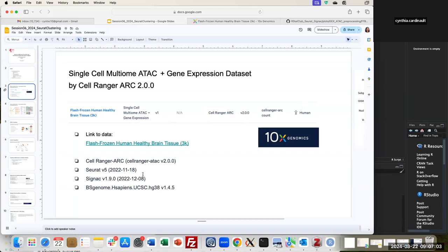The main tools we are going to use are the Cell Ranger ARC pipeline — which is where the count matrices come from — as well as Seurat version 5, Signac version 1.9, and the human genome as reference.